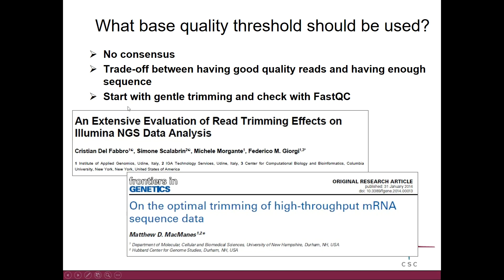What I would advise you to do is start with very gentle trimming — for example, a quality threshold of five — and then check with FastQC what the situation looks like. If it's still bad, you can always increase the base quality threshold a little bit and try again.